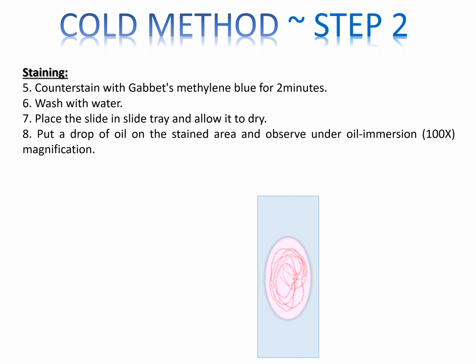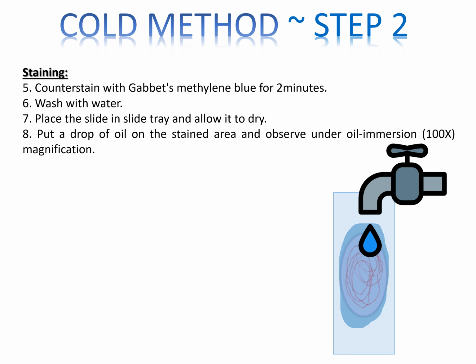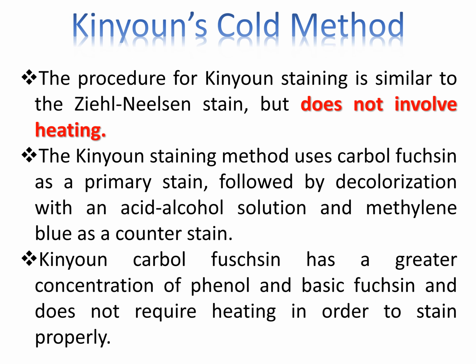Counterstain with Gabbett's methylene blue for 2 minutes. Wash with water. Place the slide in the slide tray and allow it to dry. Put a drop of oil on the stained area and observe under oil immersion 100x magnification.